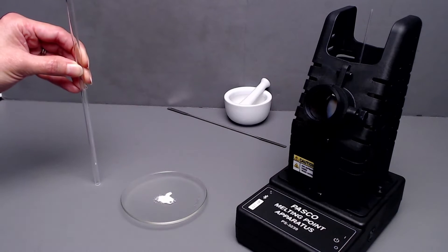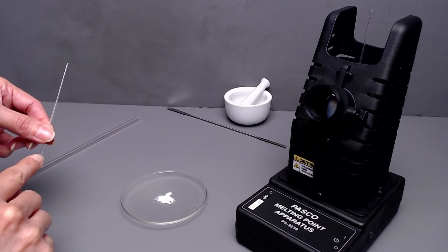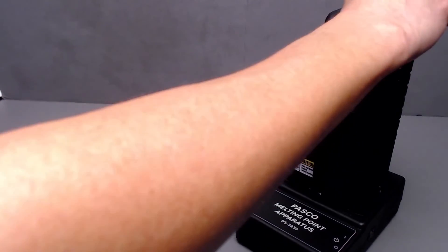Do that a couple of times and then check your height. The sample height should be between two and three millimeters, and then you can set the sample into the melting point apparatus.